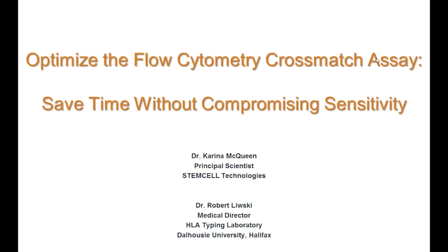We're very excited to be joined today by Dr. Robert Liwski, Medical Director of the HLA Laboratory at Dalhousie University. Dr. Liwski will be familiar to many of you already. He is the author of numerous publications in the HLA field and has recently led a Canada-wide proficiency testing program for the flow cytometry crossmatch assay. Today, Dr. Liwski will be discussing the optimized flow crossmatch protocol that he and his colleagues have developed, which reduces the time needed for the procedure by more than half without compromising sensitivity.